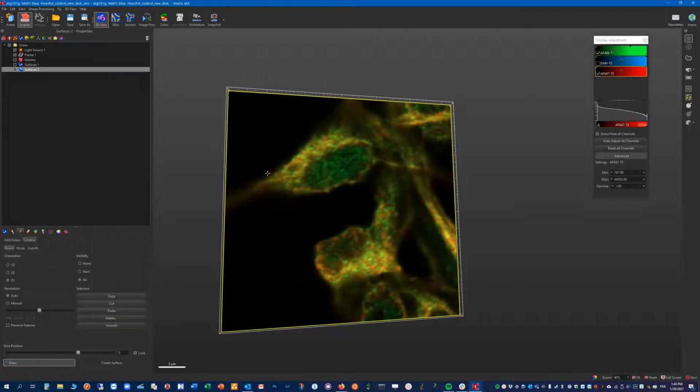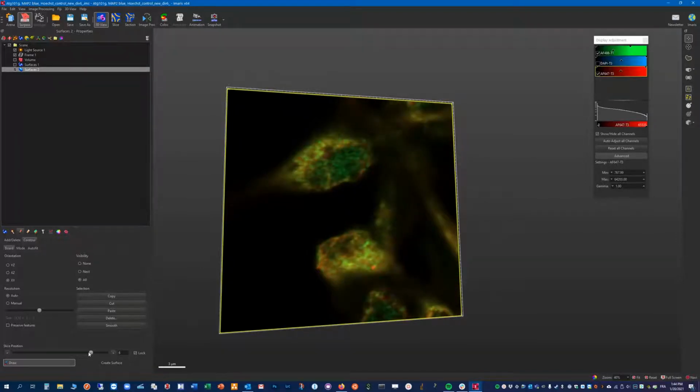I will not do them all, but you get the idea here. So something like this. Next slice.